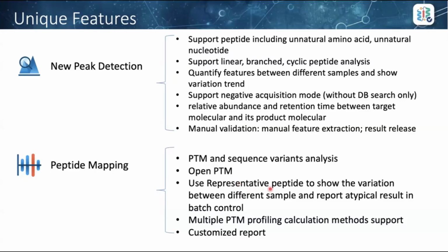And we use representative peptides to show the variation between the different samples and report atypical results in batch control that will help QC or QA analysis.